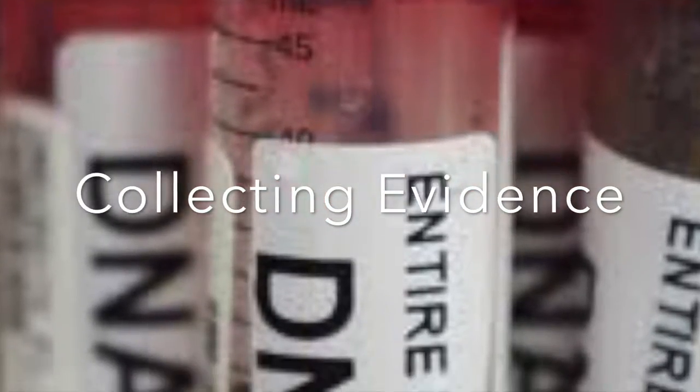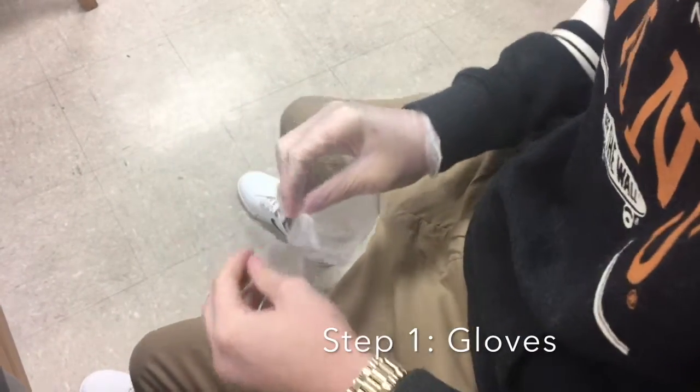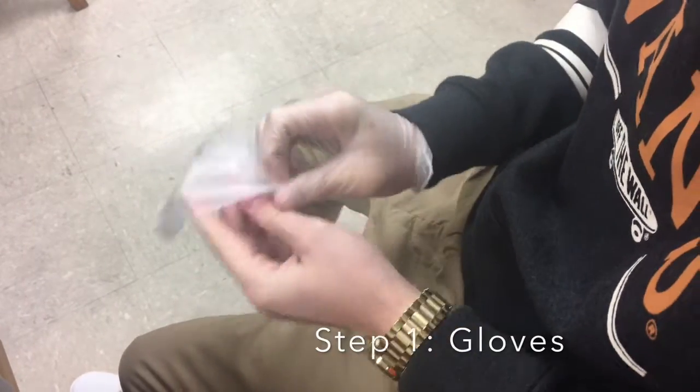Evidence is a crucial part of crime scene investigation. To start, make sure you always put on your gloves to prevent your DNA or fingerprints from contaminating the crime scene.